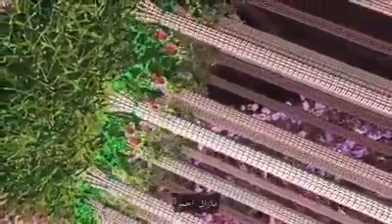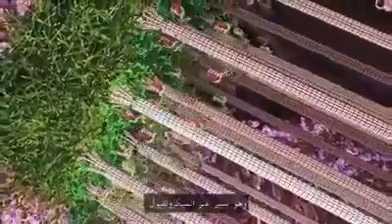It's also a tension sensing system. It's able to feel when the cell is ready, when the chromosome is correctly positioned. It's turning green here because it feels that everything is just right. And you'll see that there's one little last bit that's still remaining red, and it's walked away.